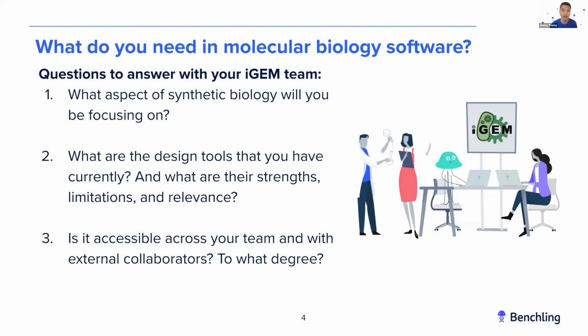And lastly, will everyone on your team be able to access the software the same way? And will you be able to give that access to other people in the way you want to? Hopefully these guiding questions can be really helpful for you all to think about as a team. And so I want to go through this exercise a little bit more.